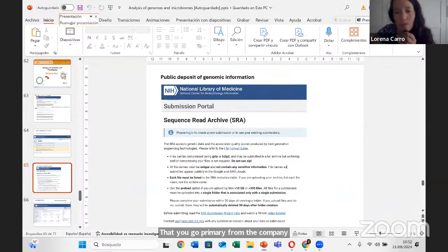This is the raw data, the real reads that were obtained from the company. It could include the adapters, or they could be already deleted, depending on who you are working with. This is an automatic step on their platforms. But in any case, this is the most direct information that we can get from sequencing, and this is one that I think is important to be submitted.